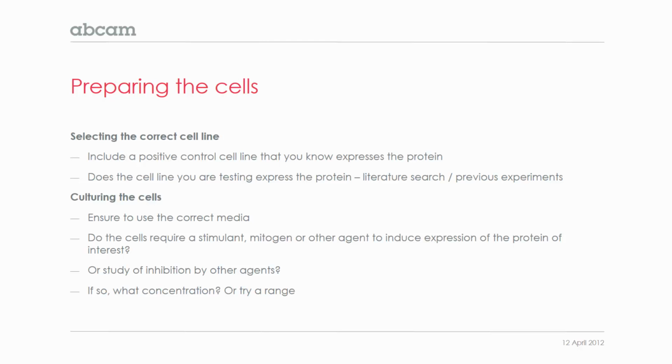When you're actually culturing the cells, there's several things you need to take into consideration. You need to ensure that you're using the correct culture media, and this information you can find again on the manufacturer's instructions or the supplier's instructions. They'll be able to tell you which is the correct culture media to use.